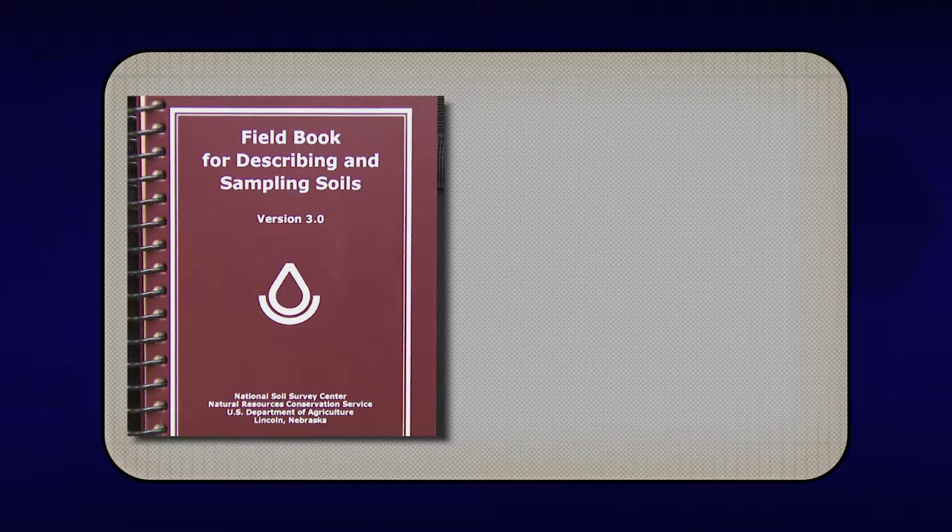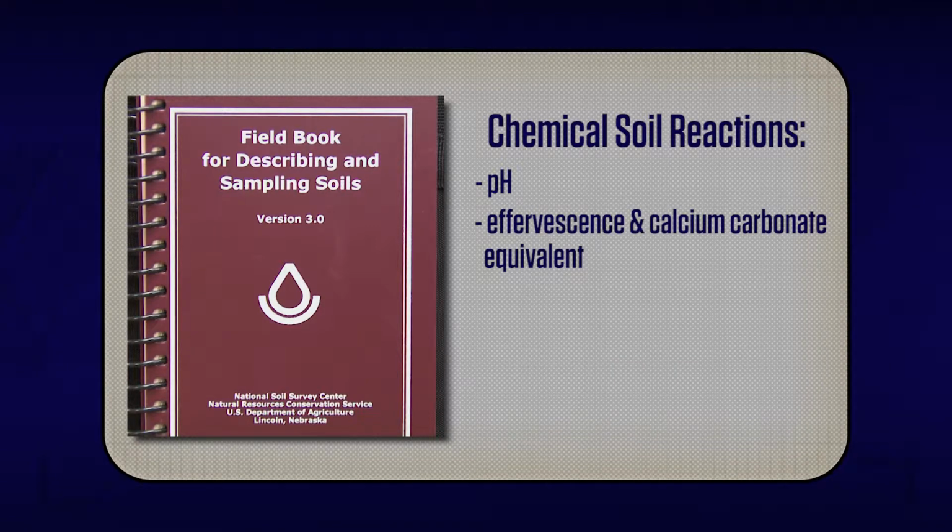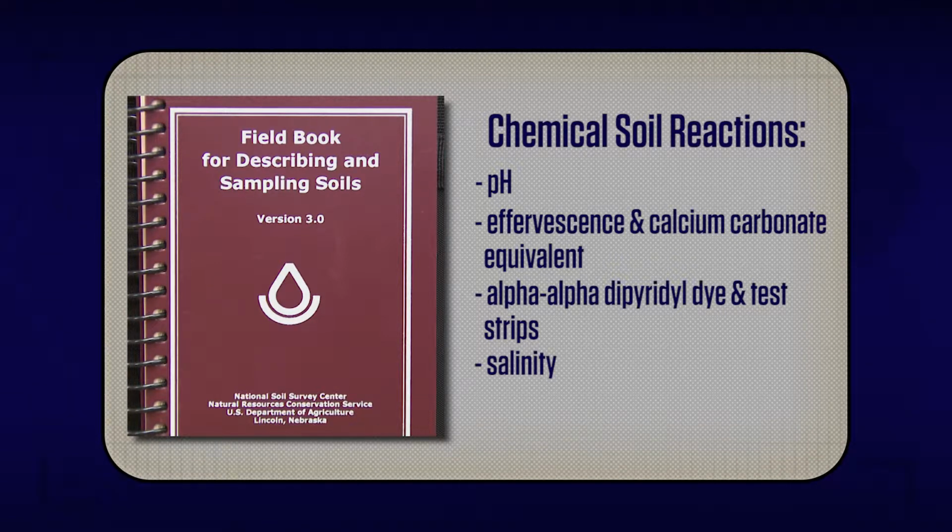technical references to collect and describe soil reaction, or pH, effervescence and calcium carbonate equivalent, reaction to reducing conditions using alpha-dipyridyl dye and test strips, salinity, and odor.